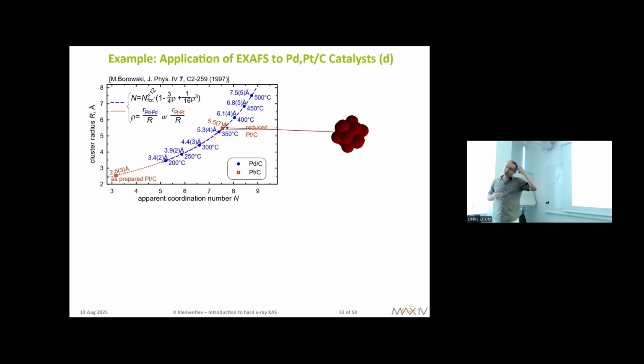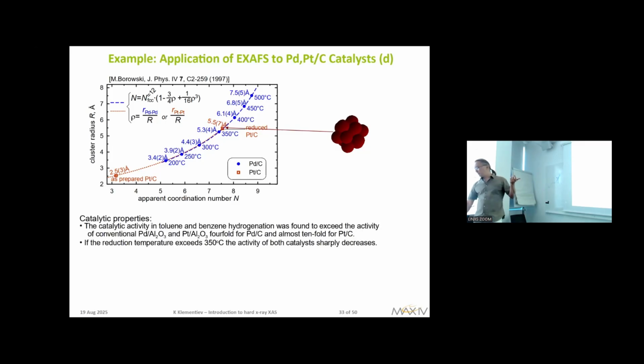Well, by this temperature programmed reduction, we don't see that they sinter. The very first suspicion in catalysis is that the particles just lump together and the specific surface becomes smaller. So you block your surface. But this is not what we see. And so the story from that paper was that, yeah, we don't see sintering.